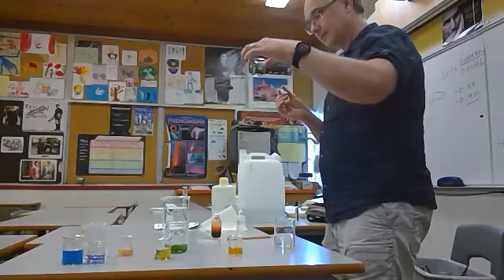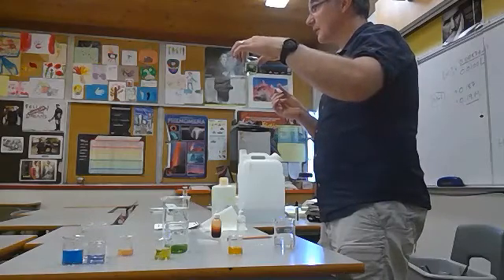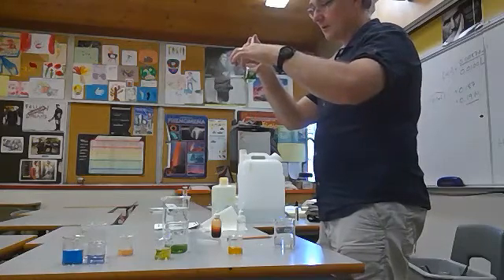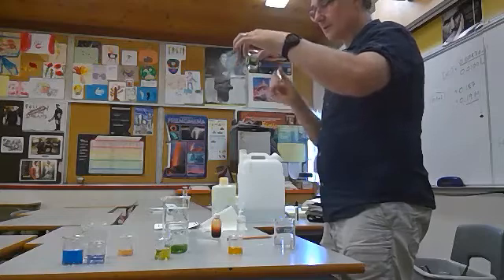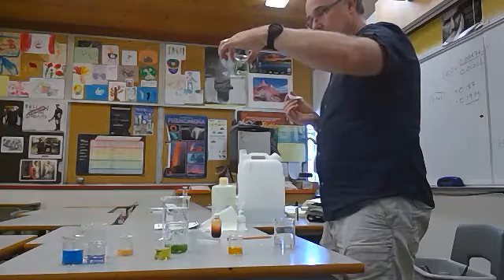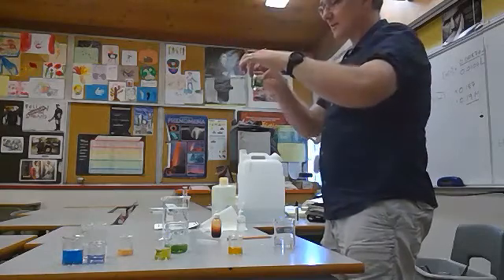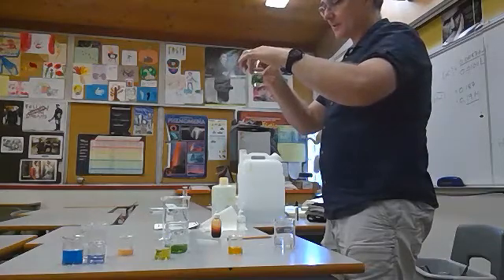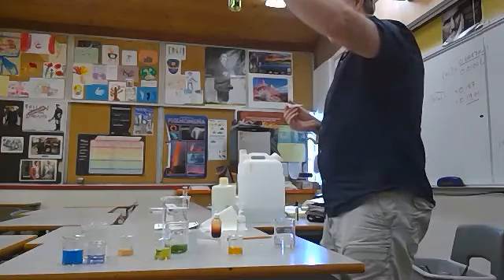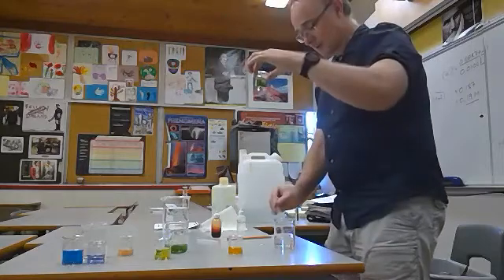Give it time. And it doesn't matter how much time I give it, it's going to stay that color. So I'm going to add like 2, 3, 4, 5, 6, 7 drops. Still green. Still green. So it's a 6, 7, 8, 9, it's a whole bunch, I just pour a whole bunch in there, okay? And maybe, I can't even tell, but I think that's a little bit lighter green than it was before. So I can just really go to town on this thing.